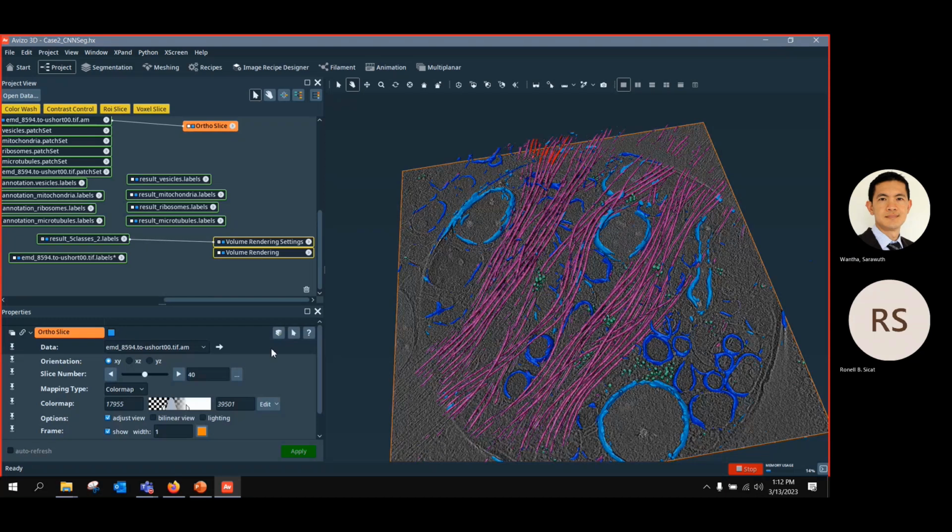Okay. So if you don't have any further questions on this new segmentation workflow, including these new AI-assisted tools, then I will go further to the next topic. Yes, can we say?